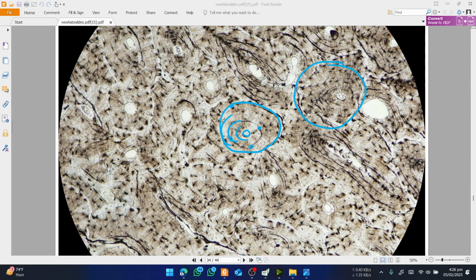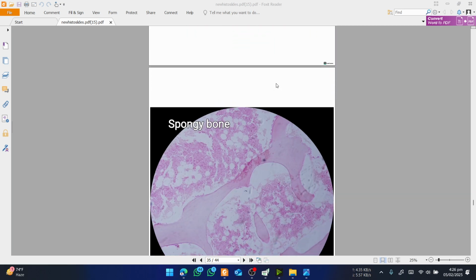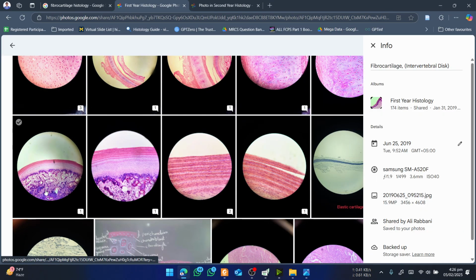So that is a Haversian system, that is a Haversian system, and you will see lamellae that are present between them. These are interstitial lamellae. Sometimes two Haversian canals, you may see them connected through horizontally running canals. These are Volkmann's canals. These are the things that will help you figure out the bone, but again its feature, its color, is very easy to identify.